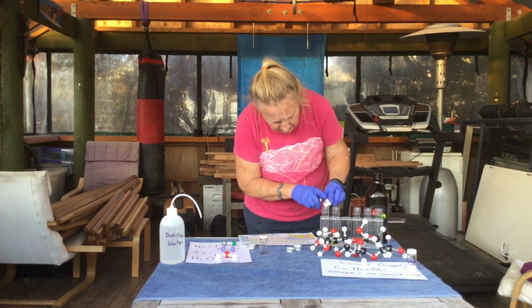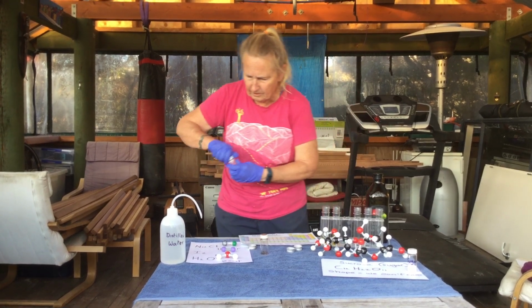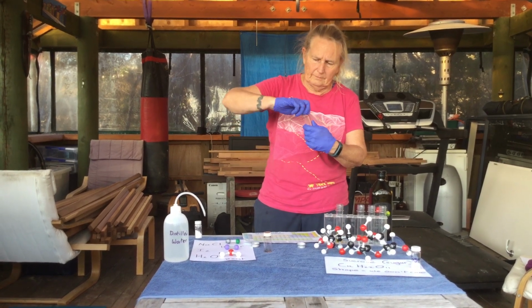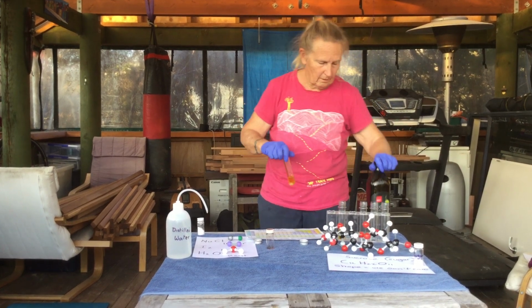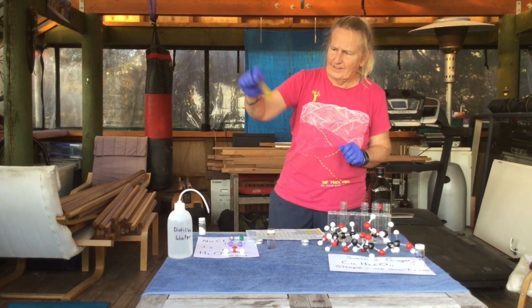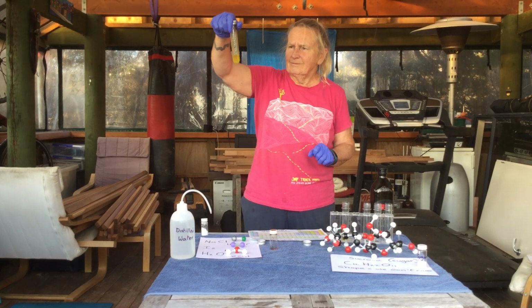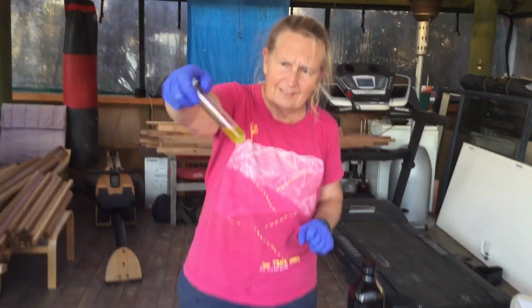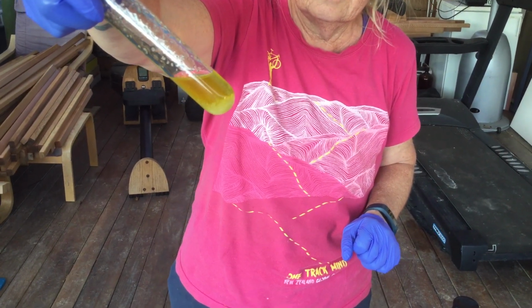I am taking predictions, but there doesn't seem to have been a lot of uptake. Okay, this is olive oil, product placement. Okay, I'm giving this a really good shake. It looks like a horrible mess. And definitely not dissolved.